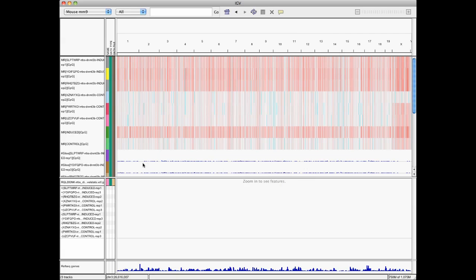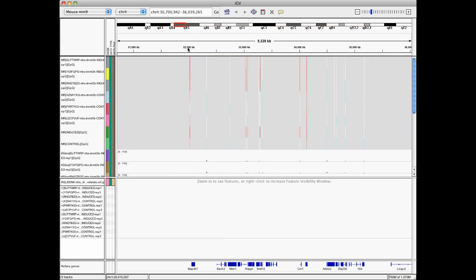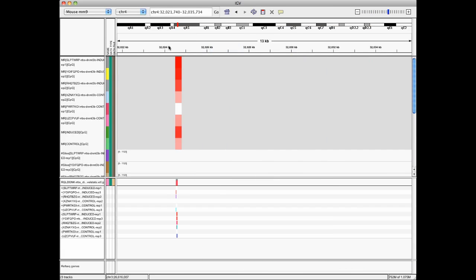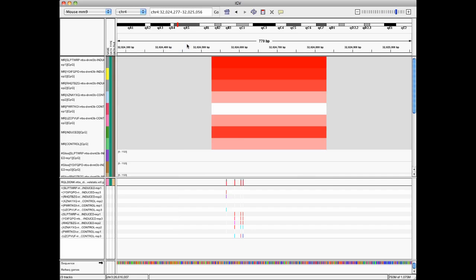So now you see different genomic intervals. Zoom in to a particular one. You can look at one CpG island, for example. Okay, so from here to here, let's see, is one CpG island. In this induced sample, the average methylation for all the Cs at this island was 100%. And now below it, we have our original VCF for the base level region.